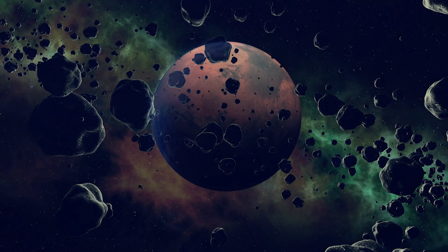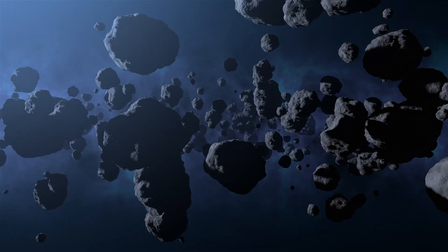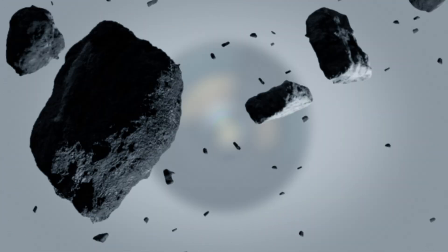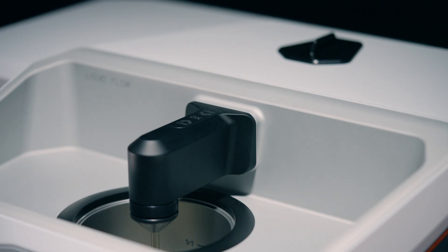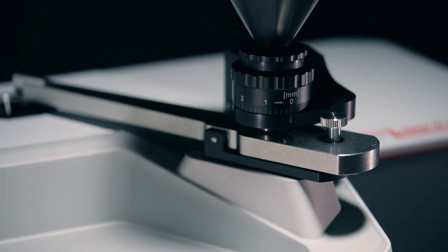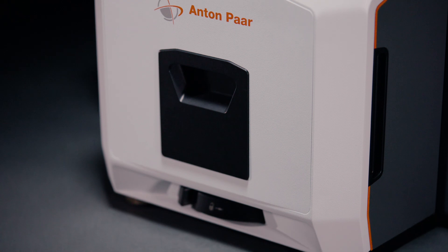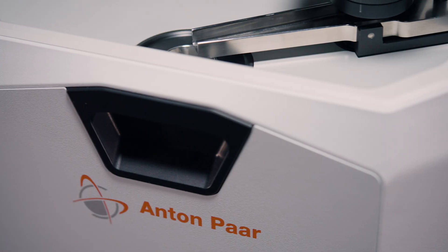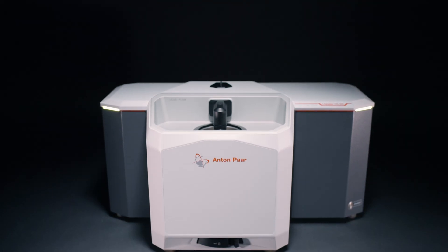Over the years, a lot of different paths, all aspiring to find an effective solution for dynamic image analysis, have been taken. But here at Anton Paar, we decided to take a superior path. And that's why we created LightSizer DIA 500, our new dynamic image analyzer.